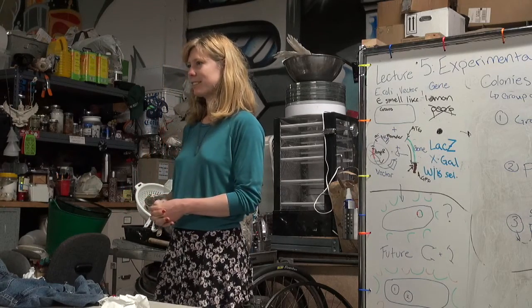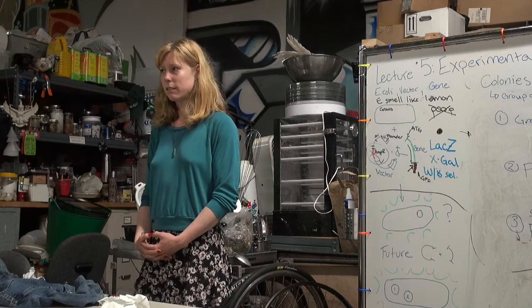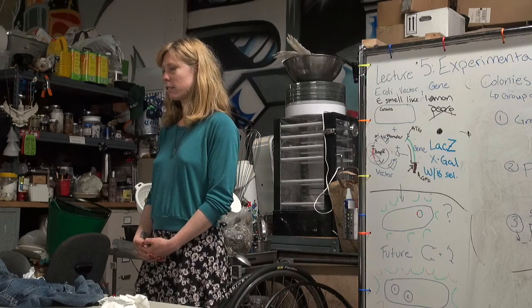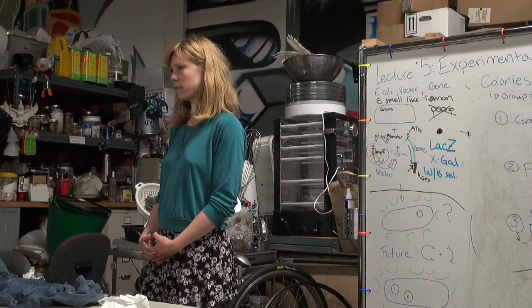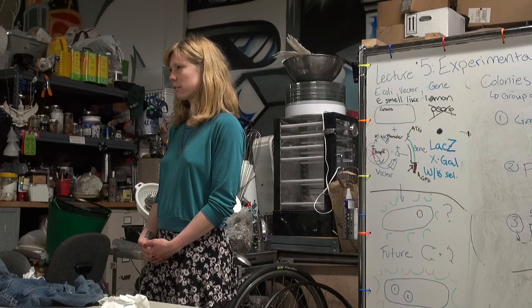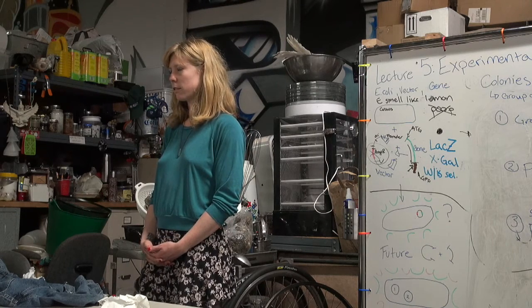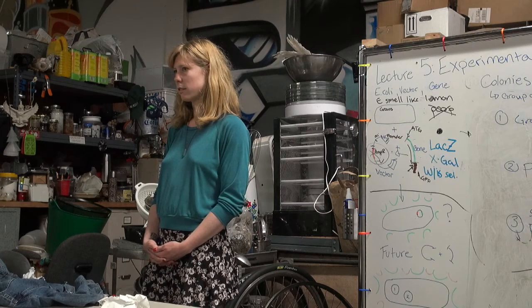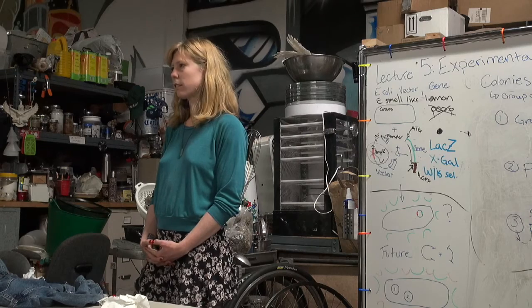More questions? From a practical standpoint, if we were doing this experiment from scratch, could you just start with a plasmid that has no AMP-R cassette, and say my gene of interest is an AMP-R cassette, and then append your gene of interest to that? Then you could just select for that and not have to worry about GFP or anything.